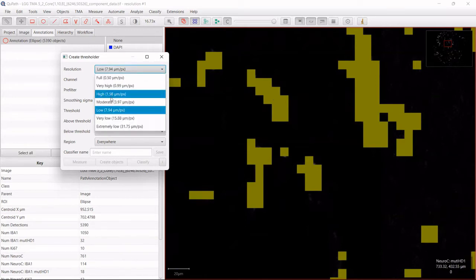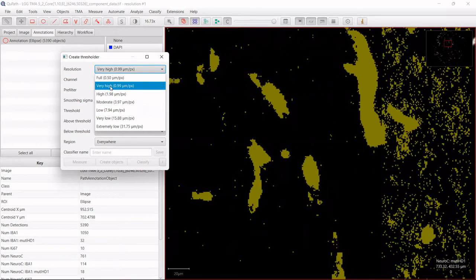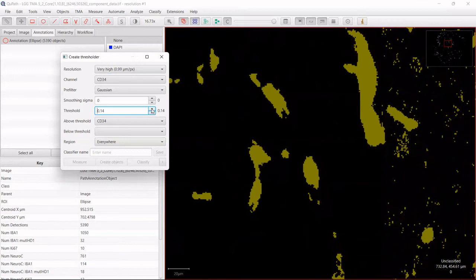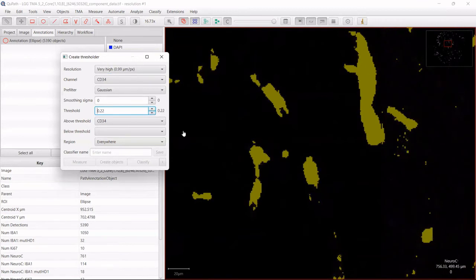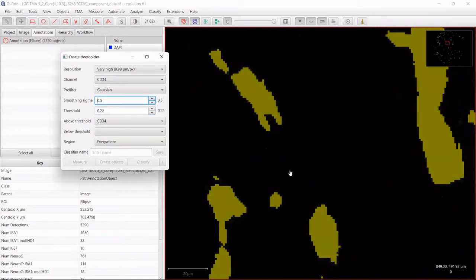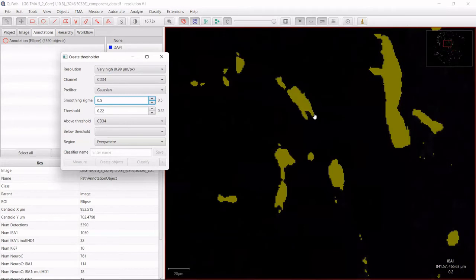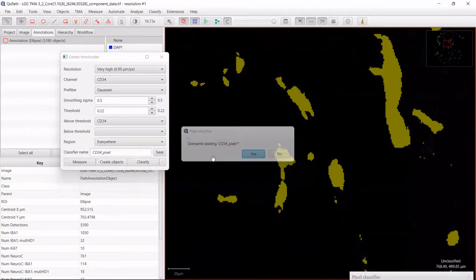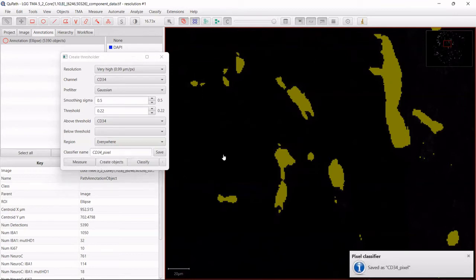You can play with what happens when you increase the resolution. In this example the dataset is not so big, so we can use a higher resolution. When we increase the threshold a bit further, we get more detailed selections of our vessels. We can also do a bit of smoothing to get quite smooth outlines. When we're more or less happy with that, we save it. I call it with an underscore 'pixel' to know it's a pixel classifier, not an object classifier. Then we just create the classifier.